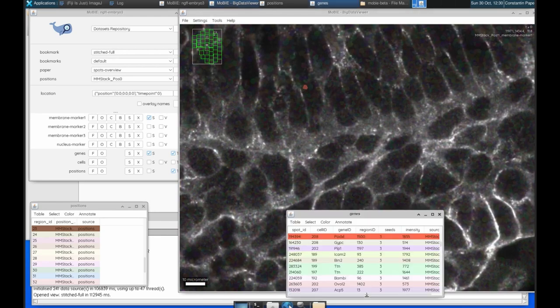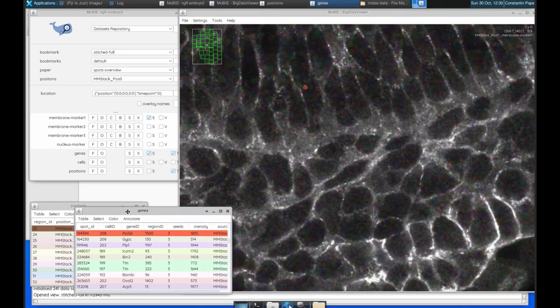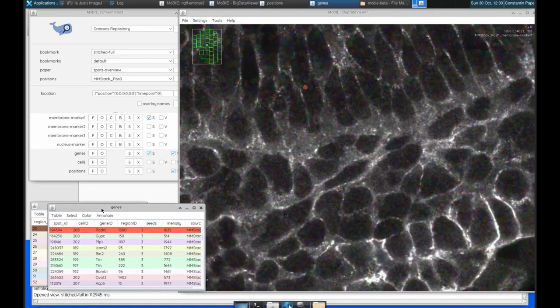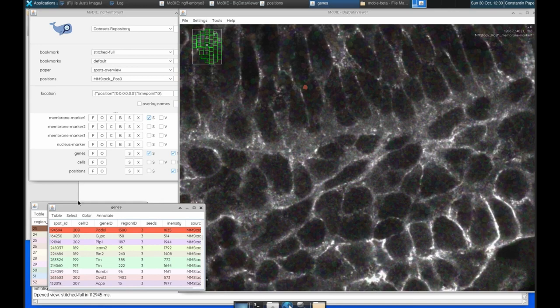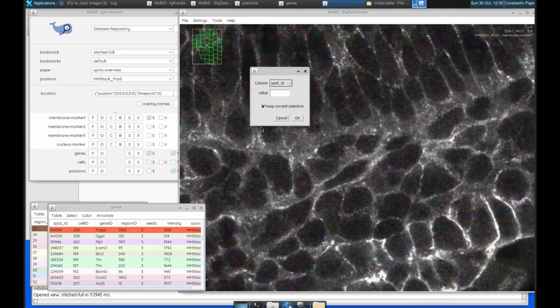So we can select a specific spot. We can look in the table and we can see by the gene ID, it expresses this pod XL gene. And if we want, we can select every spot that expresses that gene.